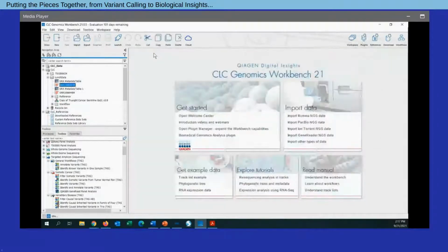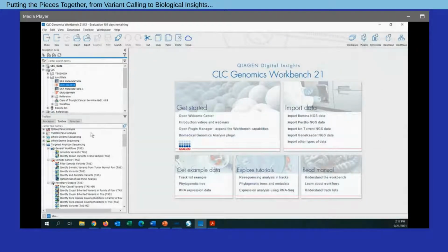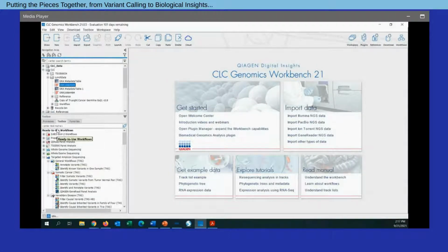And to do so, what we will refer to is the bottom left corner of the screen. In particular, in this section, we have sets of individualized tools, such as tools for mapping or variant detection or various filtering or annotation steps. But what I want to highlight today are these ready-to-use workflows. So essentially, these represent a scenario where we have built out pipelines for analysis that do all the necessary steps to process your data, and you simply have to go through a singular dialogue to process one or more samples.